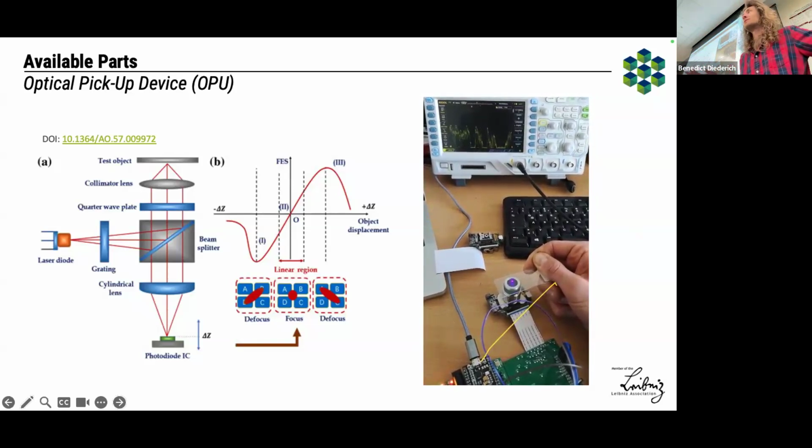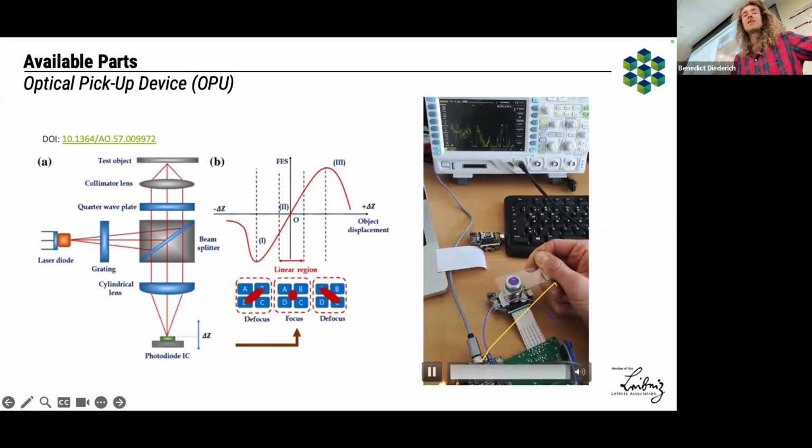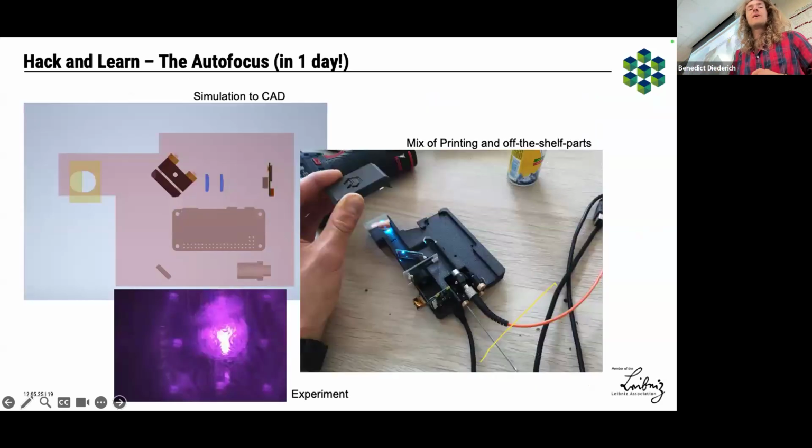Or you can use this as a source of inspiration for your own device. So you just take the optical diagrams and then simulate that maybe, or just note it down. That's something we have done. So it's basically the same idea.